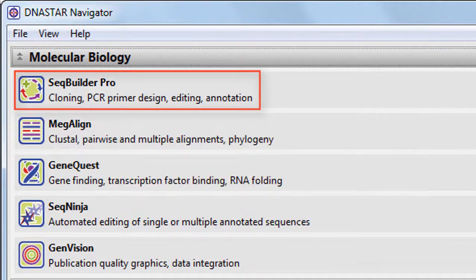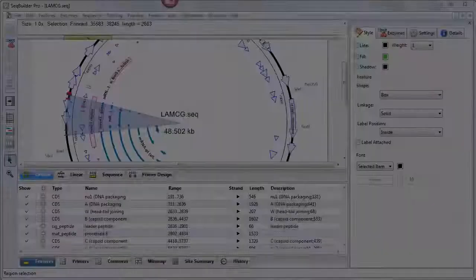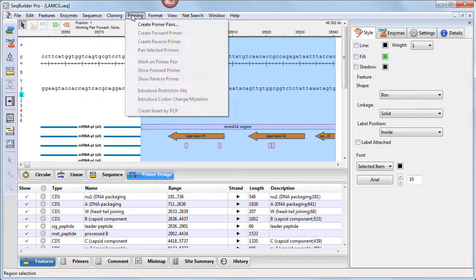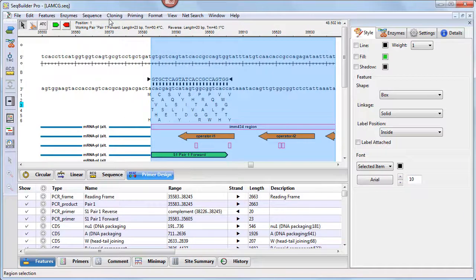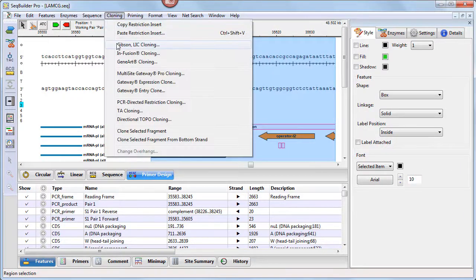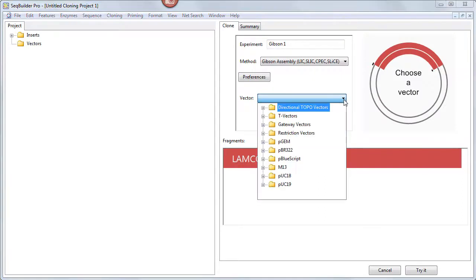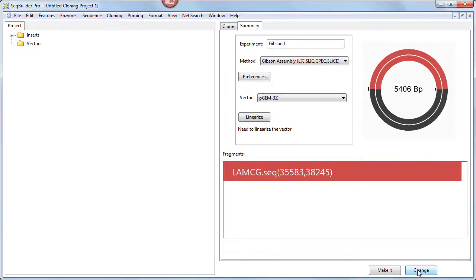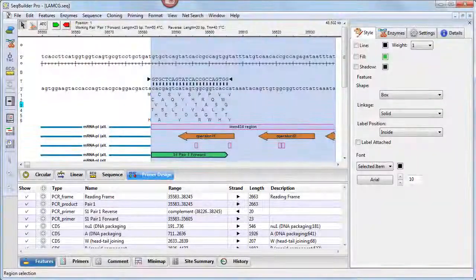This application has so many upgrades and new features that we're relaunching it as SeqBuilder Pro. SeqBuilder Pro contains all the functionality of the original SeqBuilder, including sequence map creation, primer design, and virtual cloning. But with a new upgraded user interface, it's even easier and more intuitive to use than before.